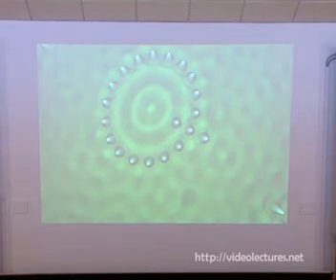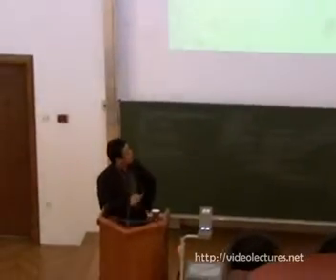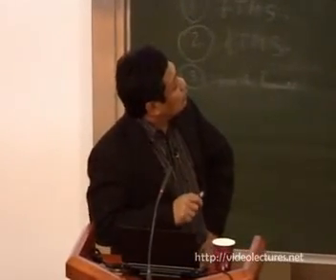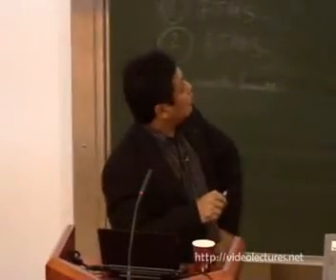Okay, so this was one of the examples before I move on. I want to explain another thing: the surface states are standing waves. One of the important properties of a metallic substrate is that there is a two-dimensional electron gas on the surface. In this case, one of my colleagues in Berlin has written this Q. Here, Q is a quantum corral of individual atoms on a copper 111 surface, and the atoms are also copper.